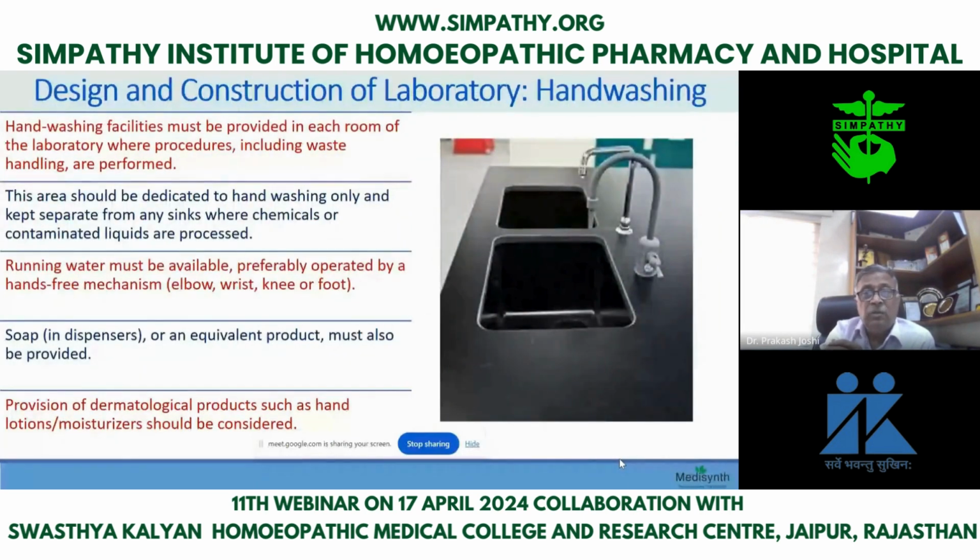Now, design and construction of laboratory hand washing. Hand washing is very important, and must be provided in each room of the laboratory where procedures including waste and handling are performed. The area should be dedicated to hand washing only and kept separate from the sink. And running water must be available because you never know if you have any burns or come across acid contact. So it is not that you have water for 2 hours. You should have continuous water. Then water again is very important.